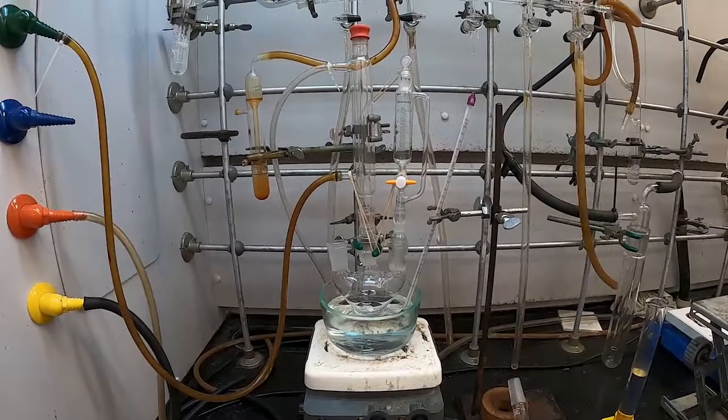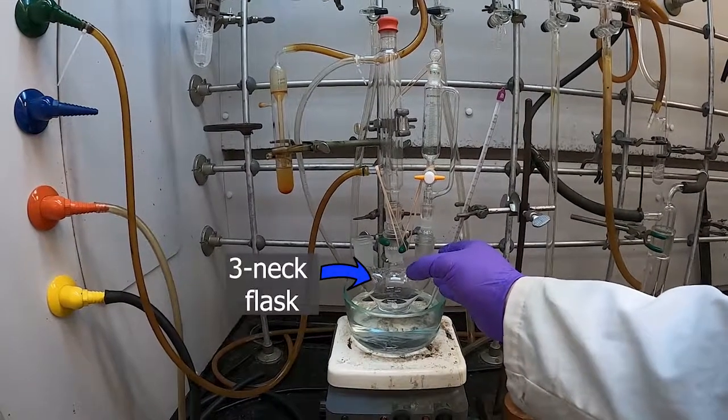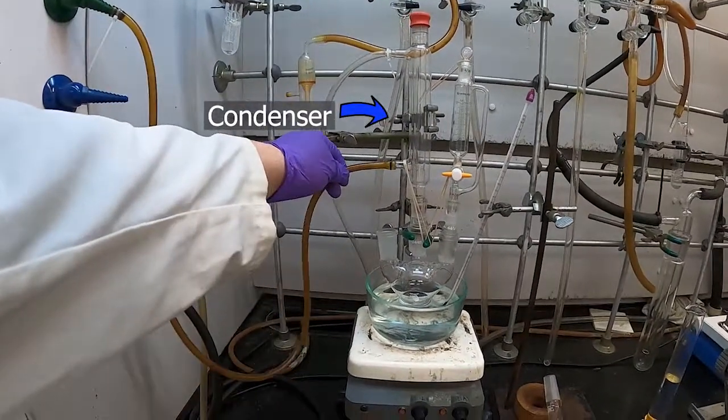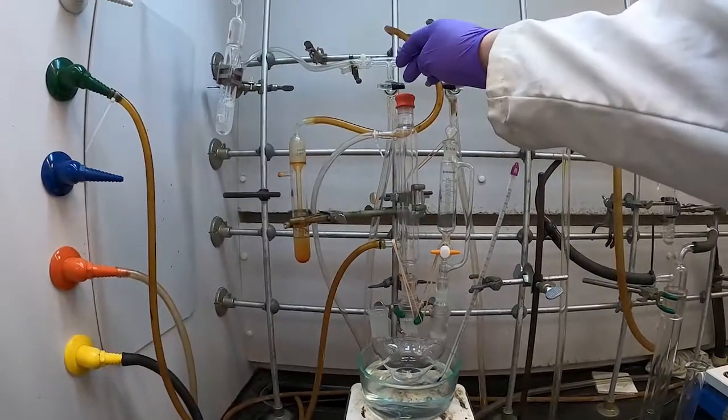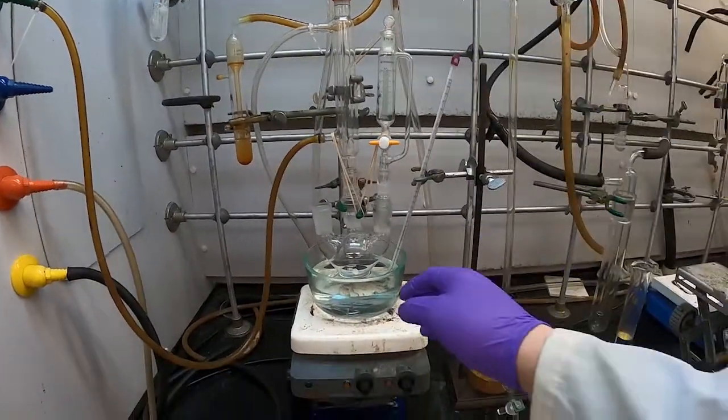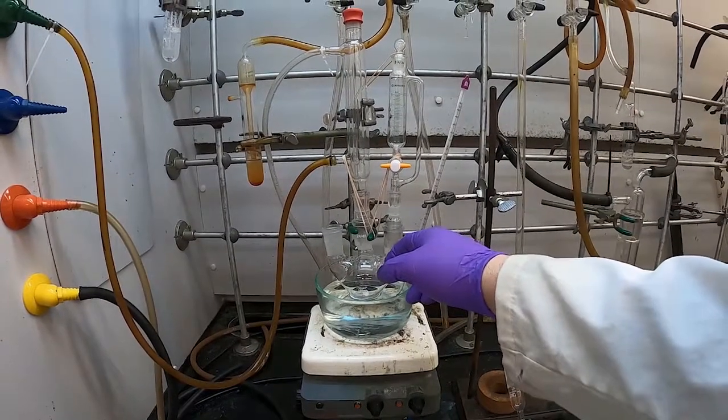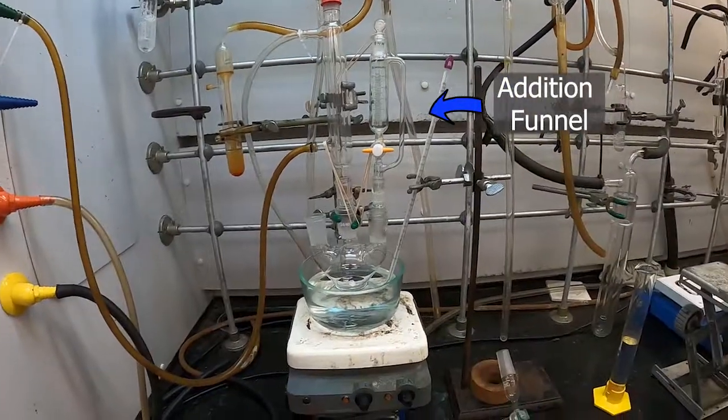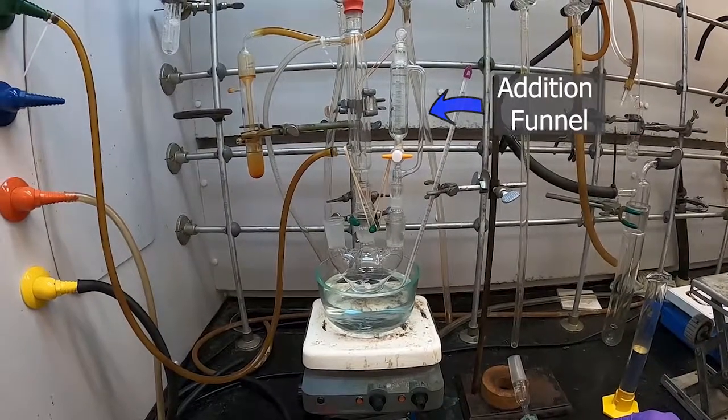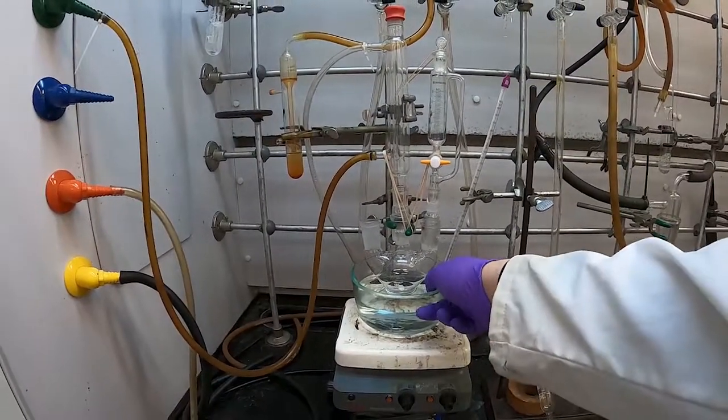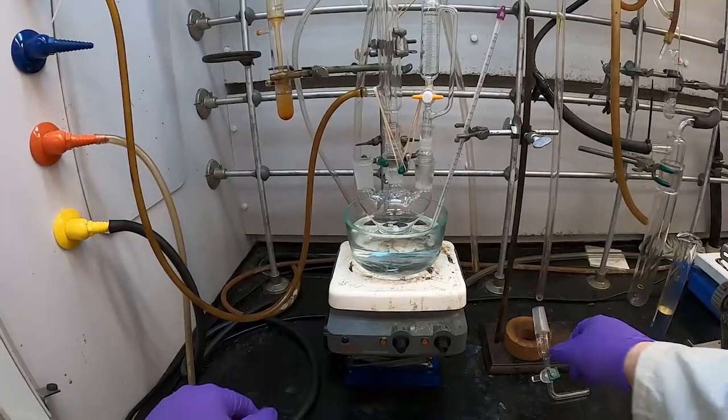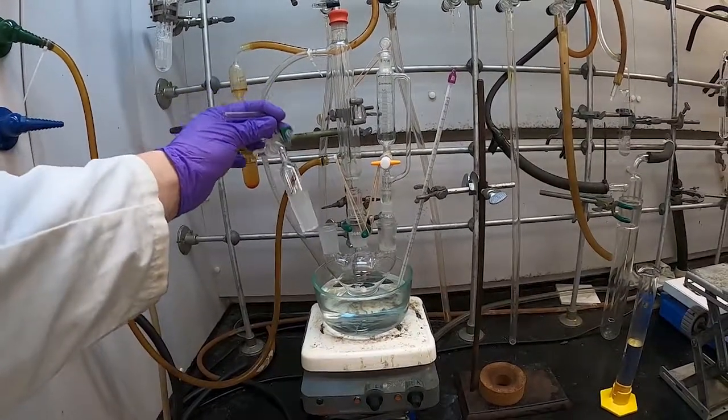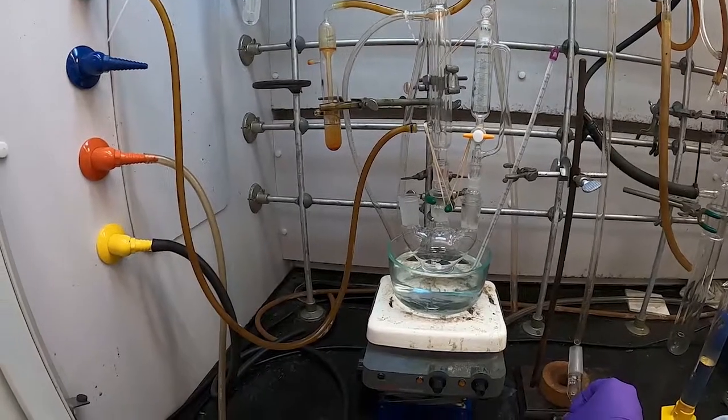So I've got here our apparatus set up. I've got a three neck round bottom flask. The center port here, I've got a condenser and the necessary adapters for that. I've got it hooked up to the water lines and those water lines are secured and the top of the condenser has a septum. On this right side arm of the flask, I've got an addition funnel that has a stopper in it. And then in our third neck, we'll have a gas adapter so that we can have a flow of nitrogen through our system.